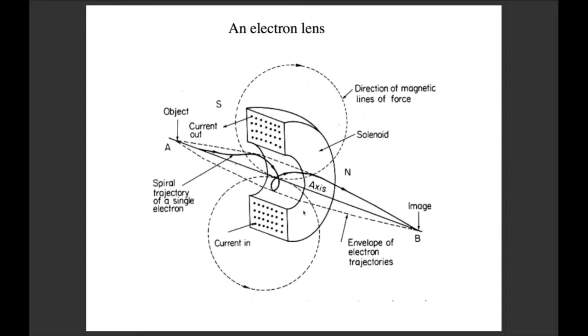Practically speaking, you actually do see this in the microscope too. When you start at low mag and go to higher and higher, you start to see your image rotate in the plane. I think the microscope has some calibrations within to correct for that, but it won't be 100% perfect. It's something to keep in mind as you go through a series of mags.